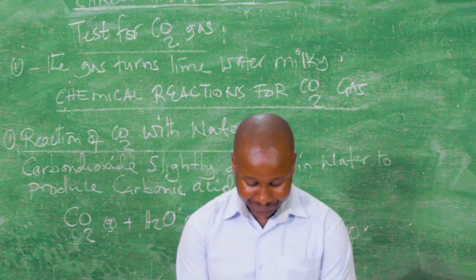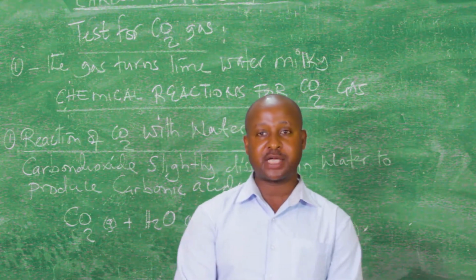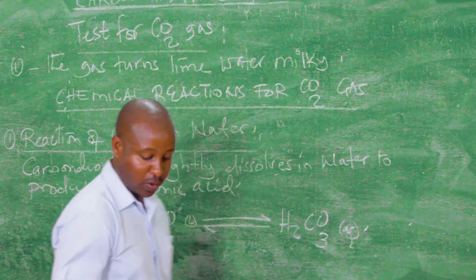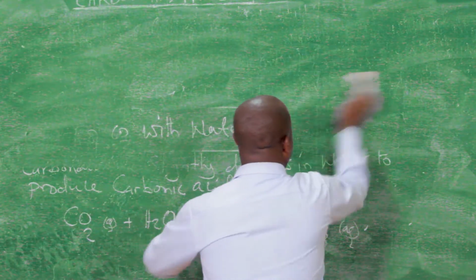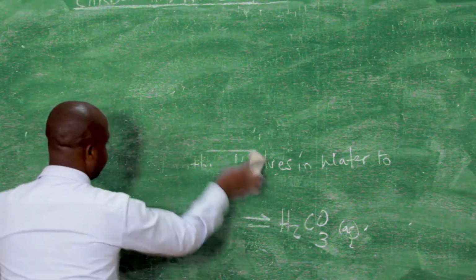Let's look at the reaction of carbon dioxide with calcium hydroxide, lime water.